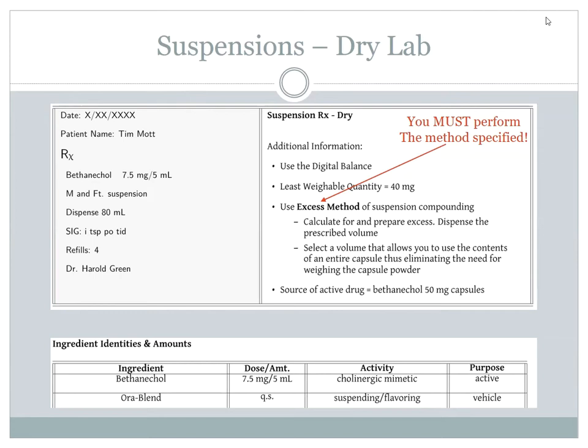Okay. We want a suspension, and the doctor wants you to dispense 80 milliliters. Okay? Can you make more than 80 milliliters? Sure, but you can only dispense 80 milliliters. So keep that in mind. That's what we're going to want to dispense.